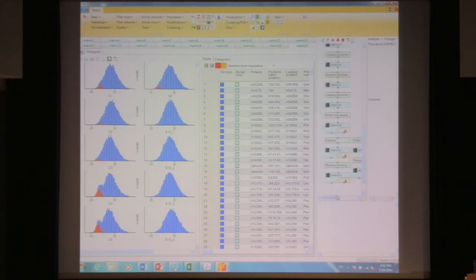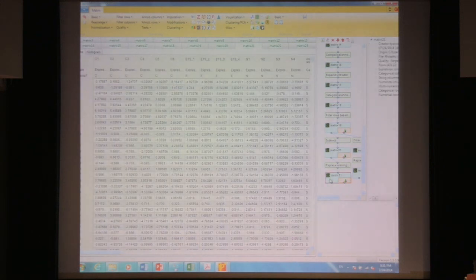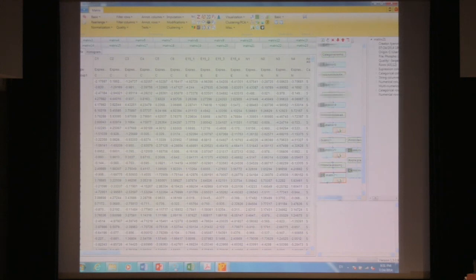But as I said, if you did that filtering, you could now lose incredibly significant populations of sites. So it's up to you what you do, and I'd say try different things and see what works for the data set. So I'm going to move on.